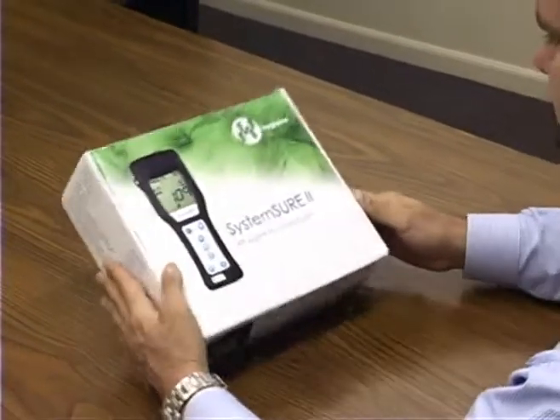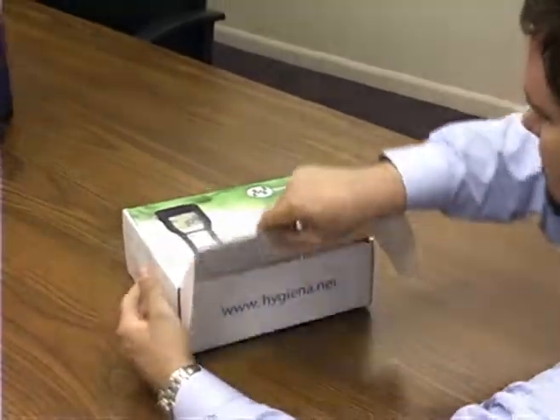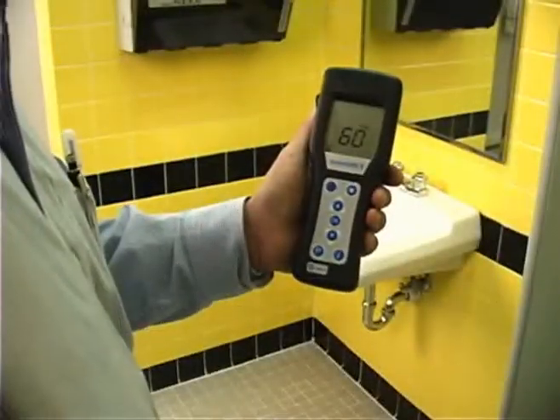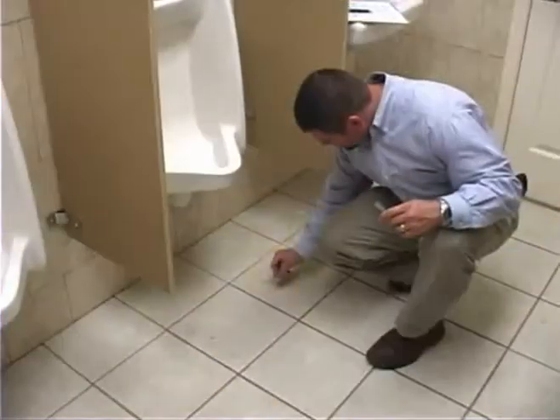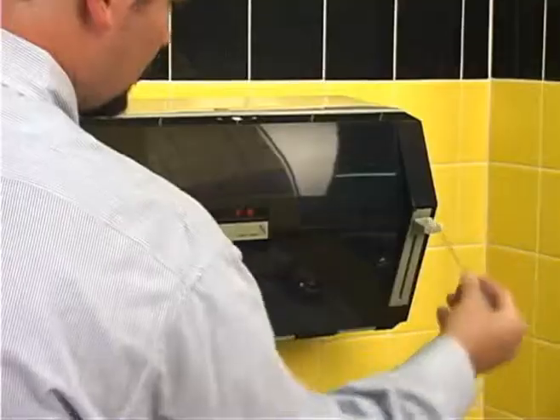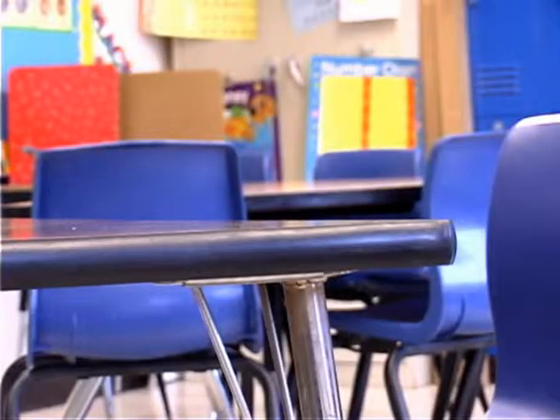Congratulations on your decision to purchase an ATP monitor from Kyvac. This handheld measurement tool is designed to rapidly measure the amount of biopollutants on virtually any surface, including floors, sink handles, toilets, dispensers, desktops, and so on.